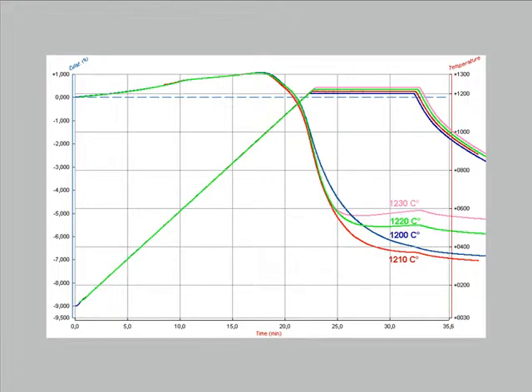In the shown example it is quite obvious that the best sintering conditions are achieved at 1210 degrees, since we get the maximum shrinkage and the sintering curve becomes perfectly flat. Rising the temperature up to 1220 or 1230 degrees, the material starts swelling, the shrinkage becomes lower and the sintering curve inverts the slope.